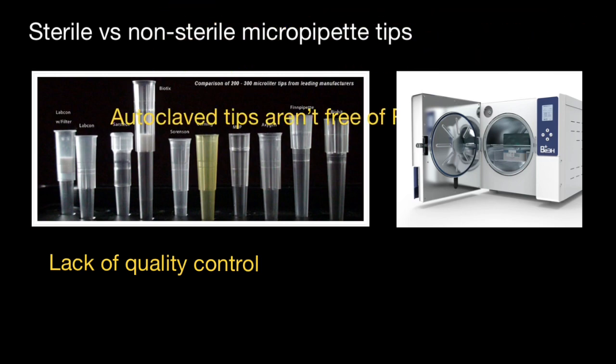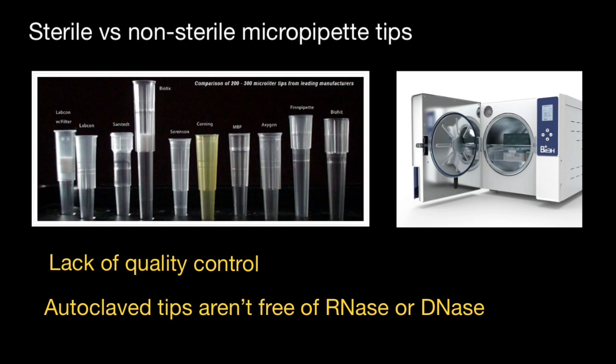The second idea I want to share is that autoclavable tips aren't free of RNase or DNase. Tips which you autoclave yourself are sterile, which means that they are free from living organisms, but it doesn't necessarily mean that they are RNase and DNase free, which are proteins.